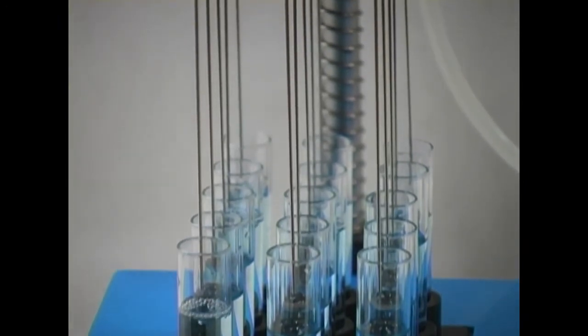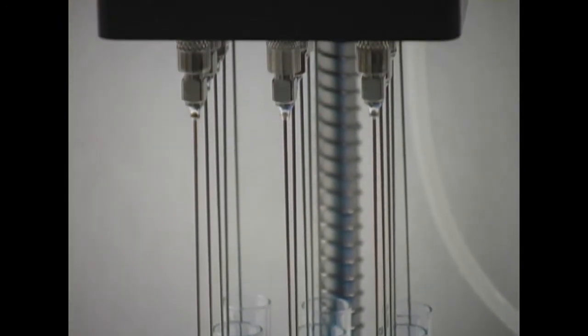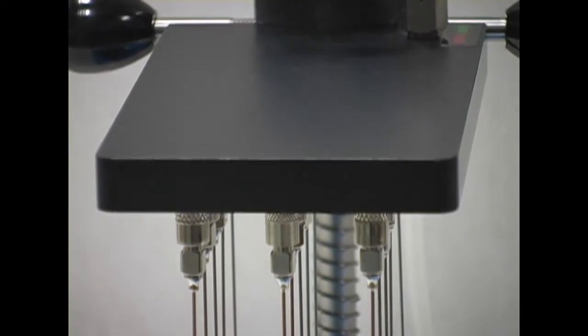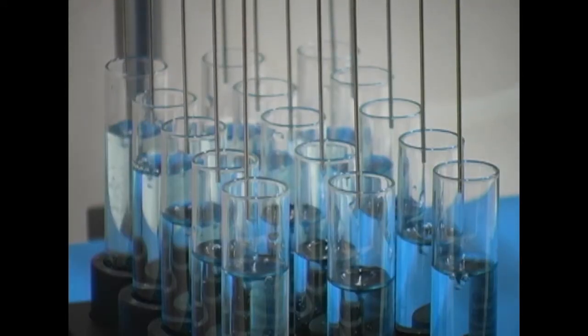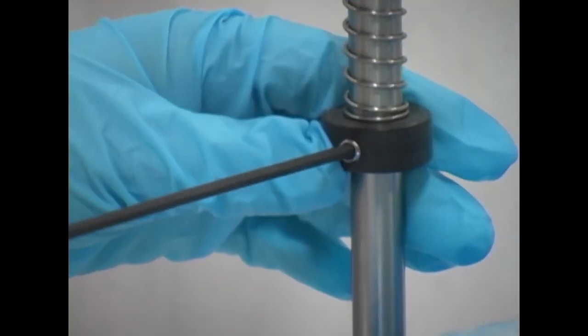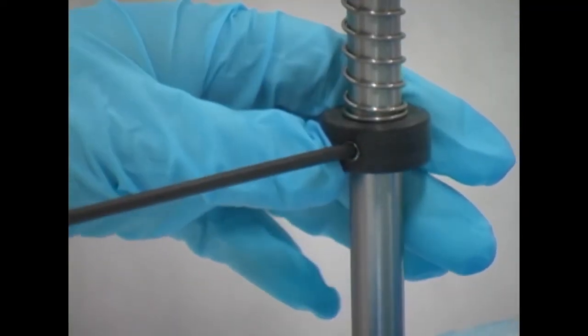The 15 position microvap comes standard with stainless steel lure lock hubs and 4 inch by 19 gauge needles. The nitrogen distribution array raises and lowers as a unit. The microvap comes with a guide groove to precisely align the needles above each sample.